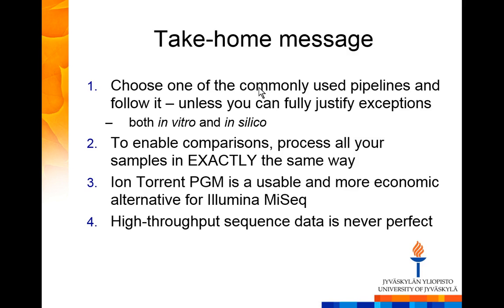The second point is that if you want to compare your samples, you really need to do everything, and I mean everything, in exactly the same way. You need to process every single sample in exactly the same way. I will show examples of that here and more about that tomorrow. Things that you would never have thought can have an effect on your community figure or community output do. And that means lots of extra money and time for you if you forget that beforehand.